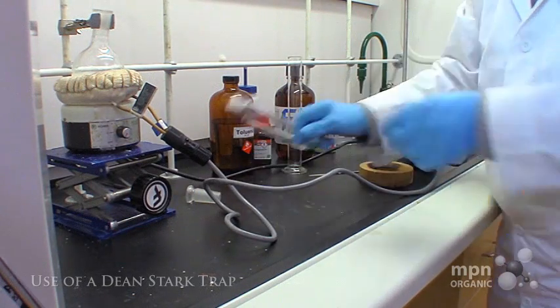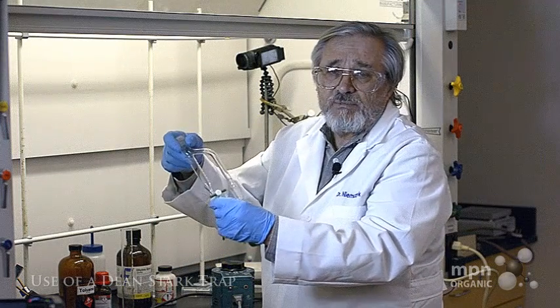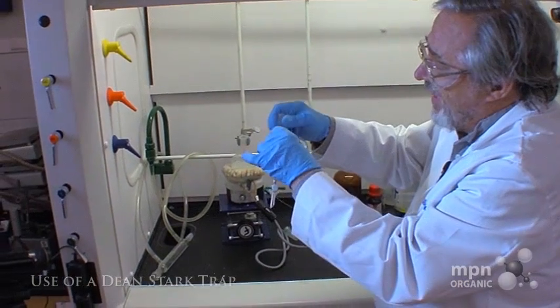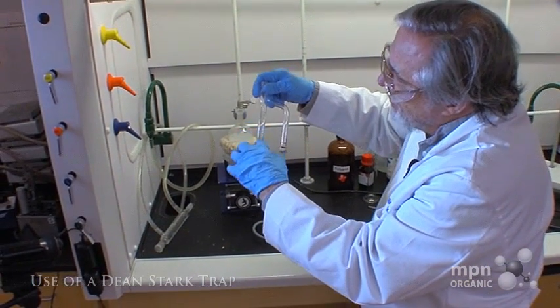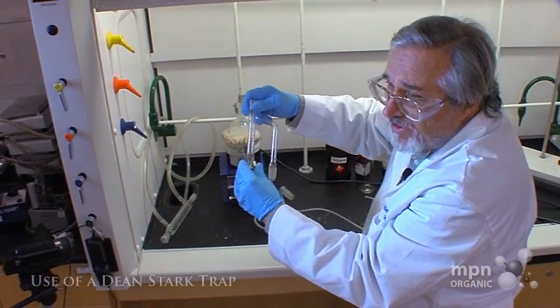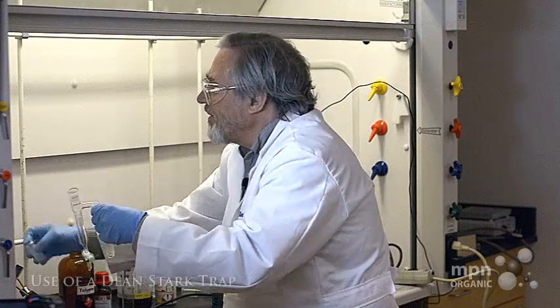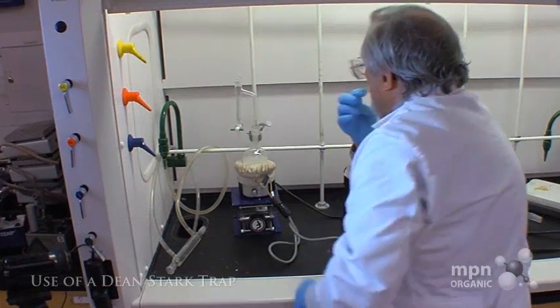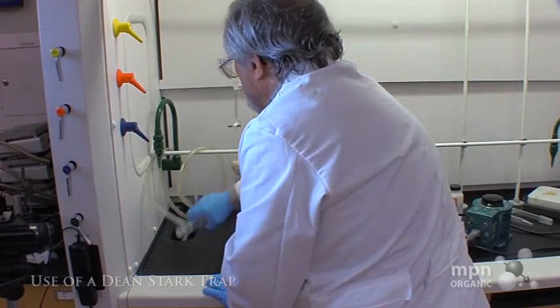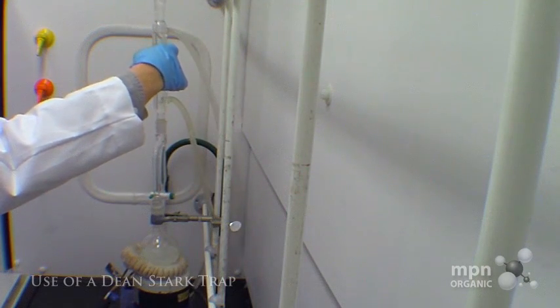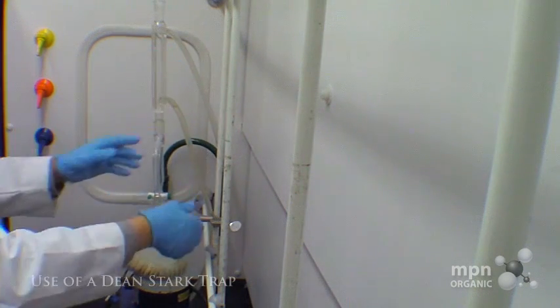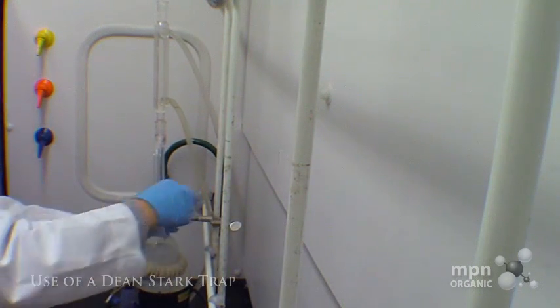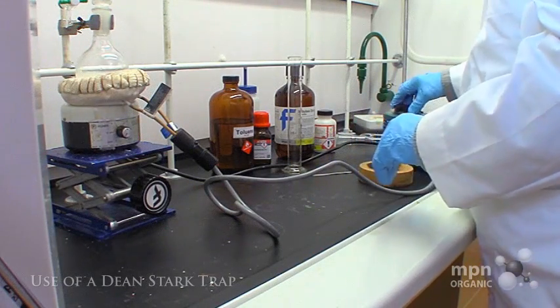Then I'm going to use what we call a Dean-Stark trap—this is what the whole thing is all about. This Dean-Stark trap is a very simple affair. You can see it's got a graduated test tube here which ends in a stopcock. I'm going to put this into the reaction vessel. And you'll see what happens when this starts to heat up. Let's get that nice and tight there, and let's start this.